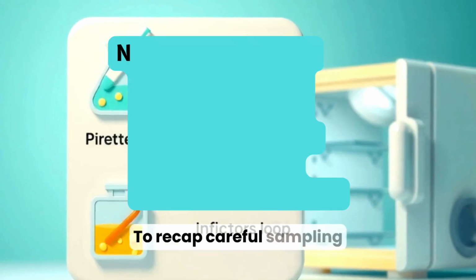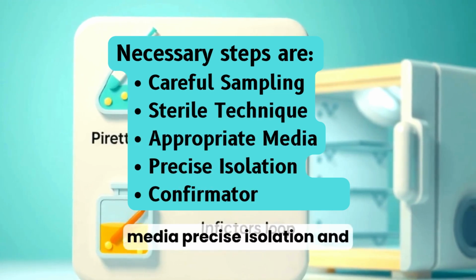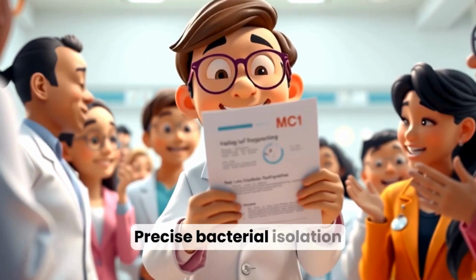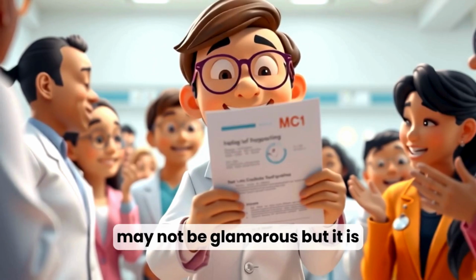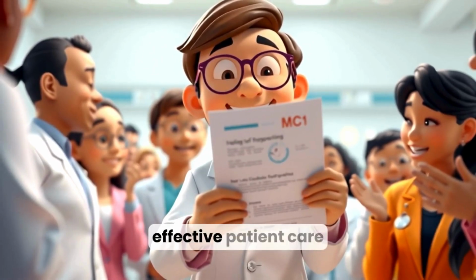To recap, careful sampling, sterile technique, appropriate media, precise isolation, and confirmatory testing are all necessary steps. Precise bacterial isolation may not be glamorous, but it is vital. It turns samples into answers and guides safe, effective patient care.